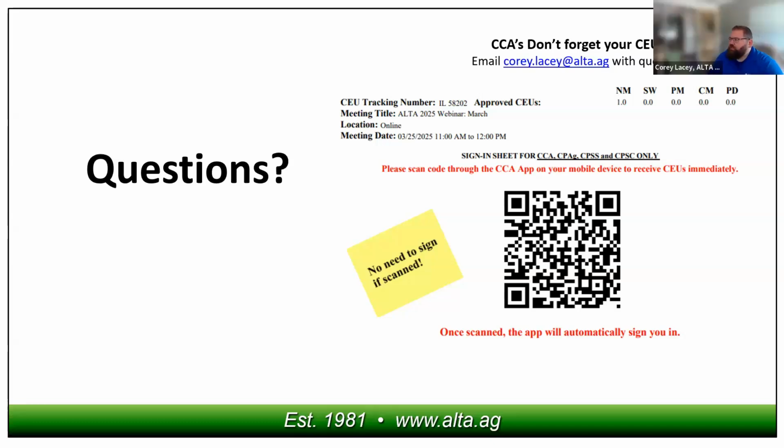So I followed up in the chat there just asking if the question was in regards to slowing down analysis time or actual issues with the analysis. And so we may dive back to that question here in a second. Oh, well, there you go. I've observed that the initial reading is not representative of the internal standard reading later in the run. The initial is 100%, but everything later is lower.